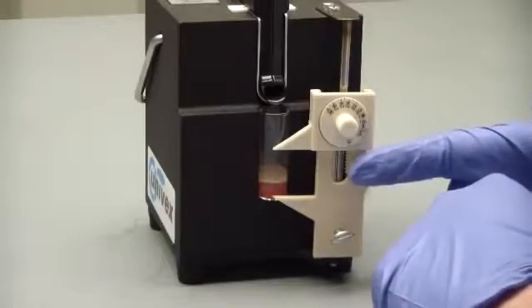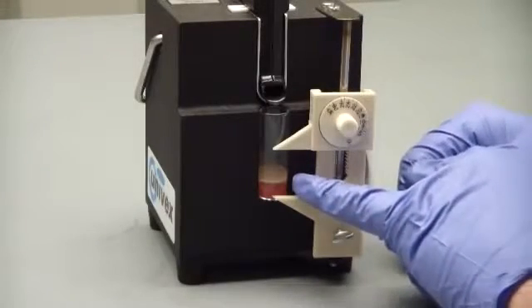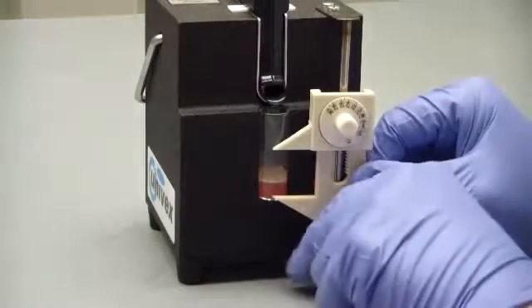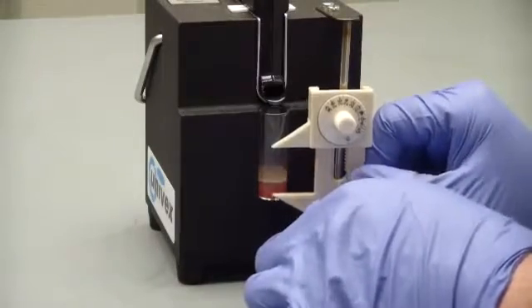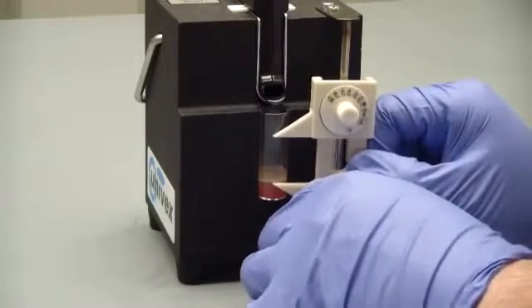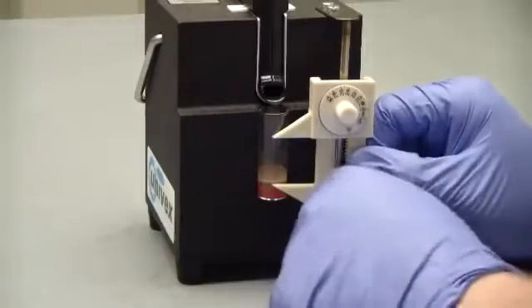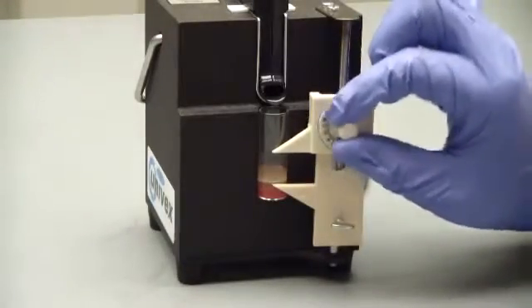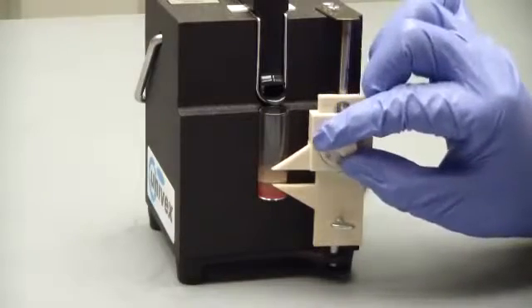When measuring the liquid, you are going to be measuring the clear or fat liquid. First step is to loosen the screw so that you can raise the lower jaw to the bottom of the fat. Tighten your screw. Now, using the dial, lower the upper jaw to the top of the liquid.